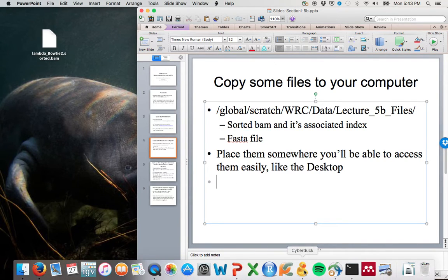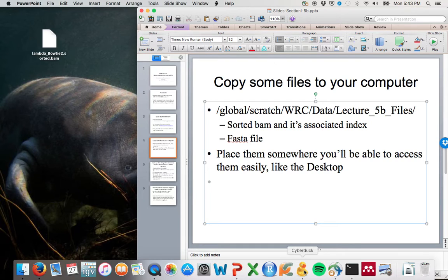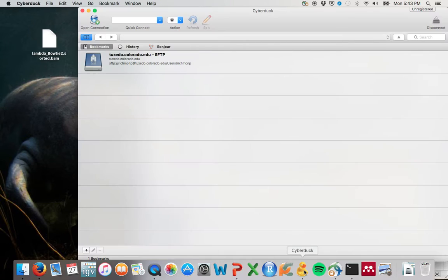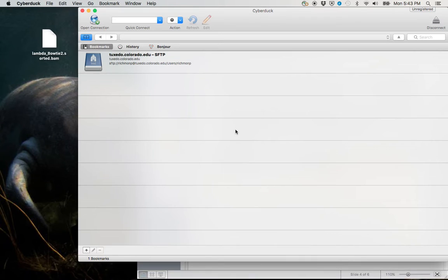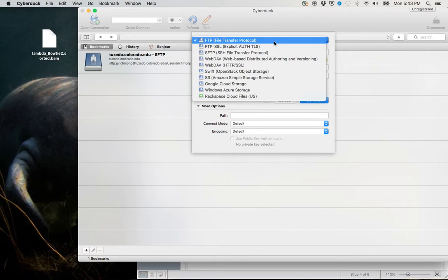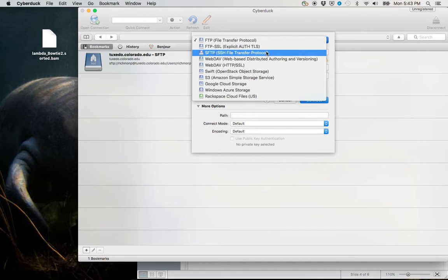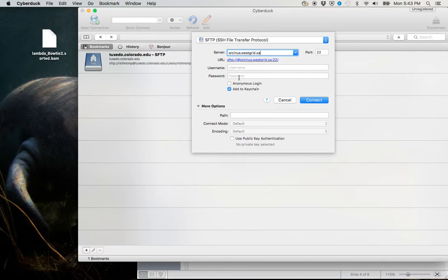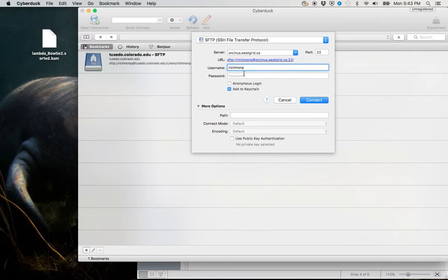If you are on a Mac and you want to use the SCP command, that also works. And if you're on a PC, I recommend using WinSCP. So I open up my client, CyberDuck. I click up here for Open a New Connection. The protocol is SSH File Transfer Protocol. The server, again, orcinus.westgrid.ca. I enter in my credentials. And it already knows me. You're just going to want to leave that on port 22.